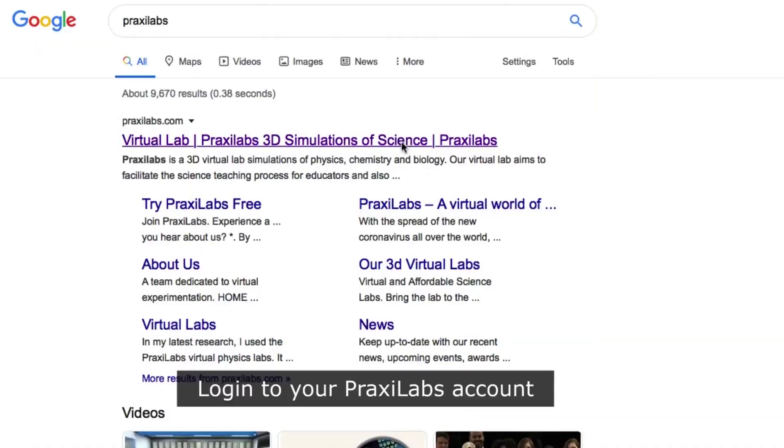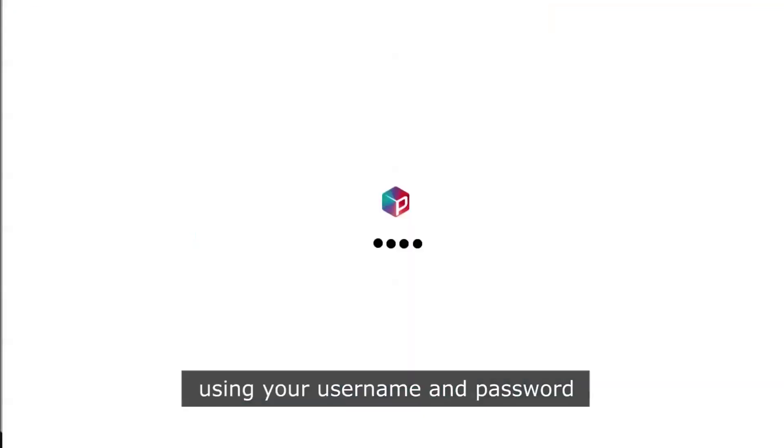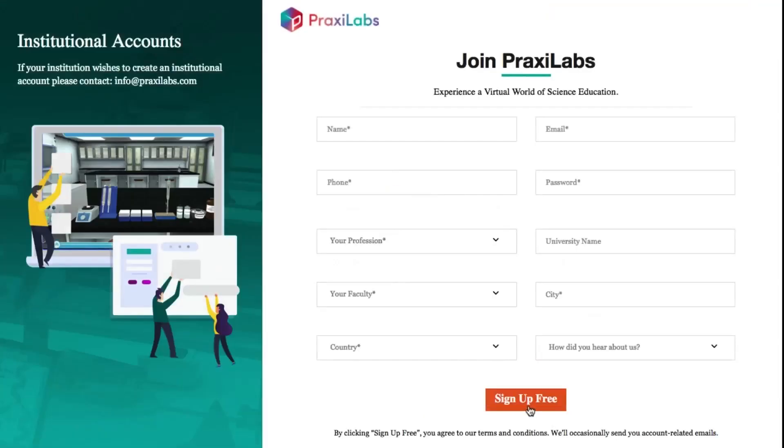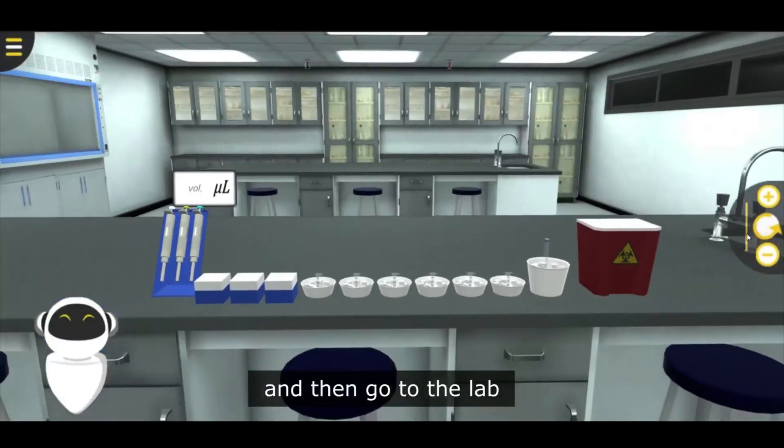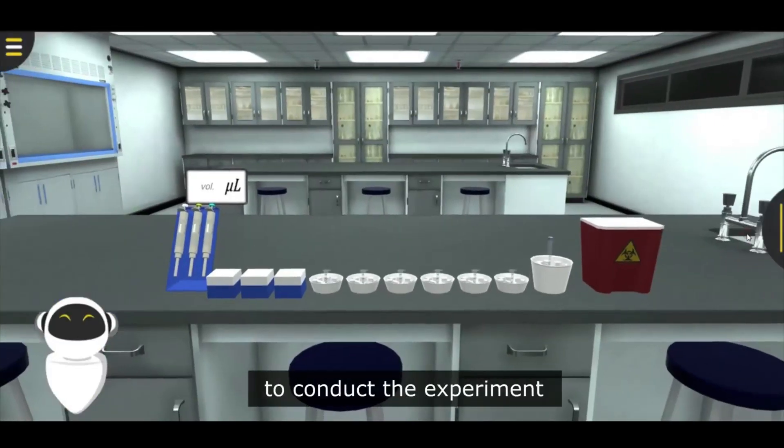Log in to your PraxiLabs account using your username and password, and then enter the lab to conduct the experiment.